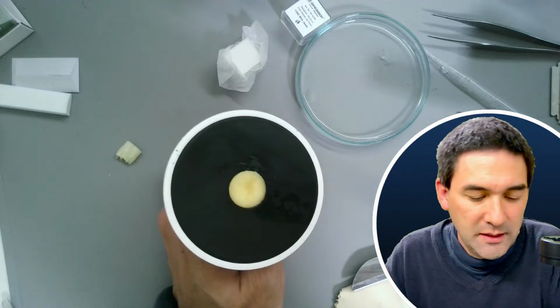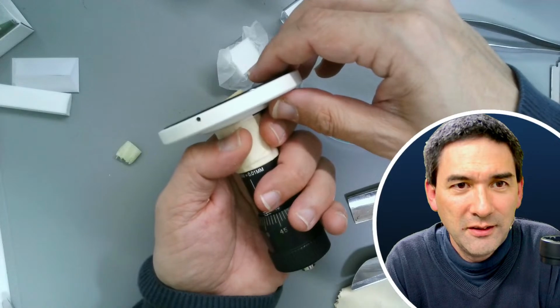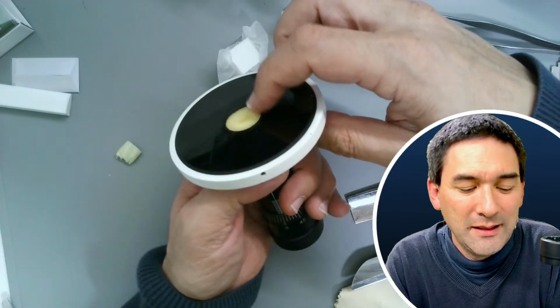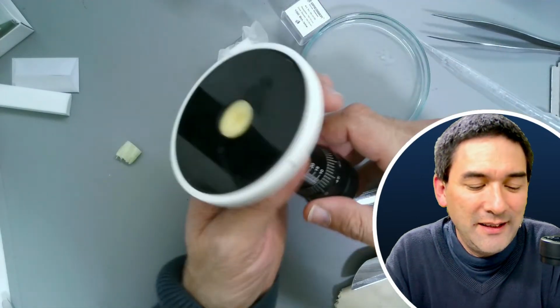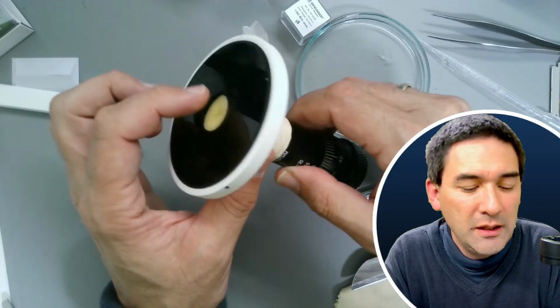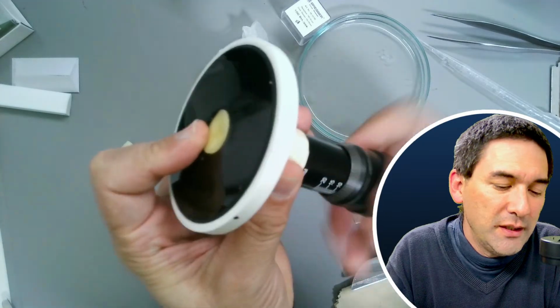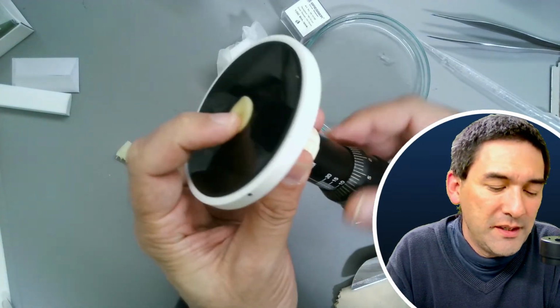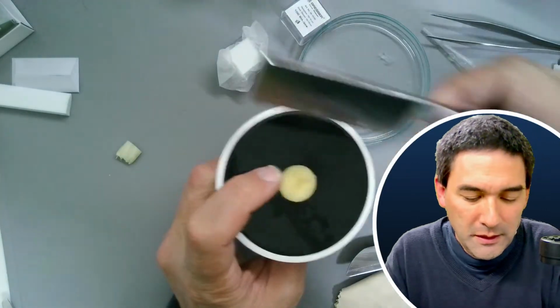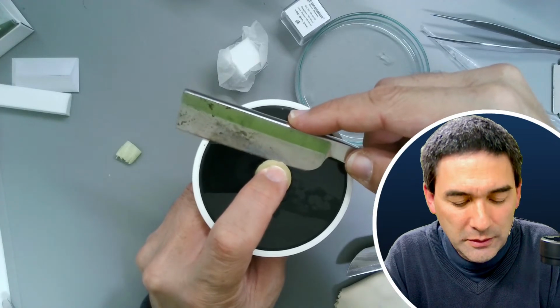Very nice. Okay. And ooh, look, do you see this here? Aha. See, that already shows you the disadvantage. It was lifted out. And now essentially it's flush on here, and now it goes in. So that is essentially the problem with this here, right? There is no clamp. So maybe, I don't know, somehow hold it in here without cutting myself.